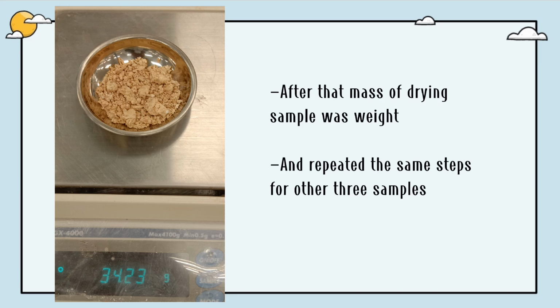After that, mass of drying sample was weighed and repeated the same procedure.